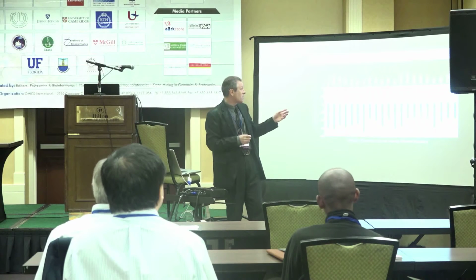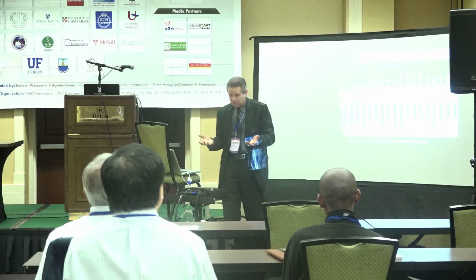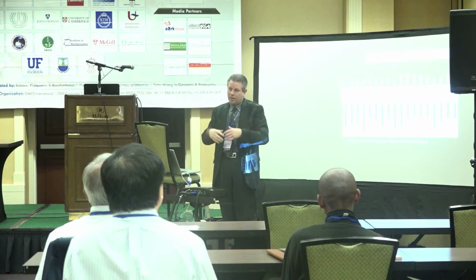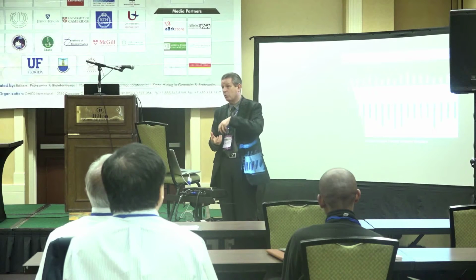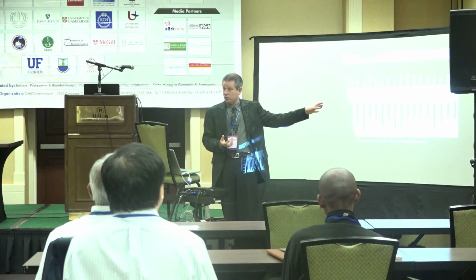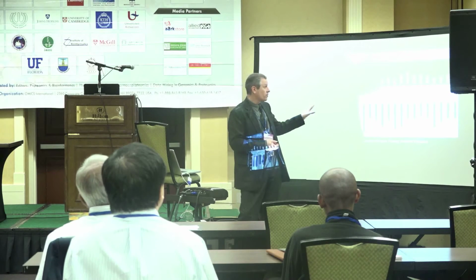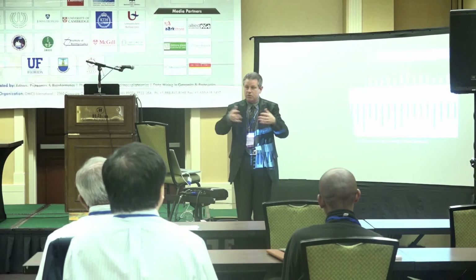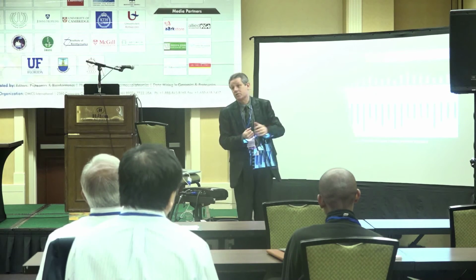Well, what happens is, with the antibody microarray, you can capture your proteins on the array with the antibodies, and usually the ATP will get washed away, depleted. So then when you go in with your probe, you can get the label. I showed you earlier that we get nice labeling with the FSBA probe. This is with purified kinases. Now the advantage is that we can take crude cell lysates that have a larger repertoire of kinases. This is with 200 kinases that we did this.